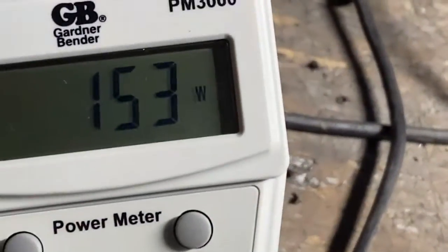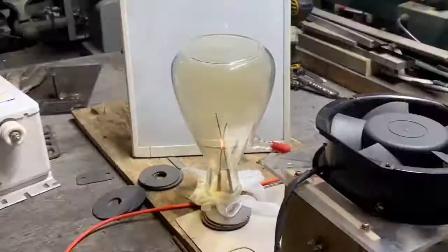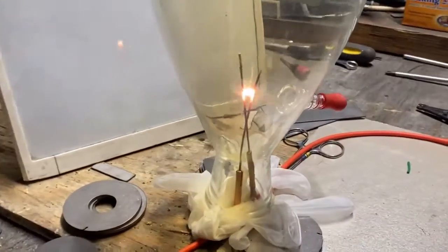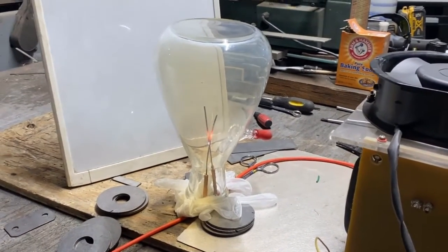Whoa, that thing's going freaking crazy — I wish you could see what I'm seeing. That's only 153 watts. It's kind of weird — we're getting brown gas! I don't know if that's more efficient, but it is brown gas. Oh crap, the water just went up big time. I think we just smoked the tungsten rod — that white smoke coming off might be tungsten rod.